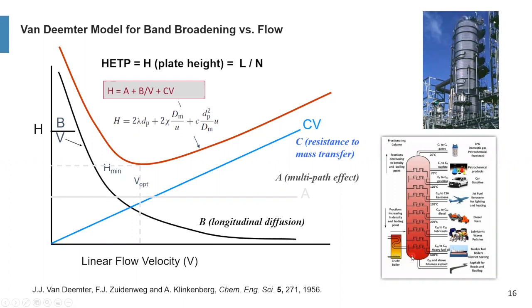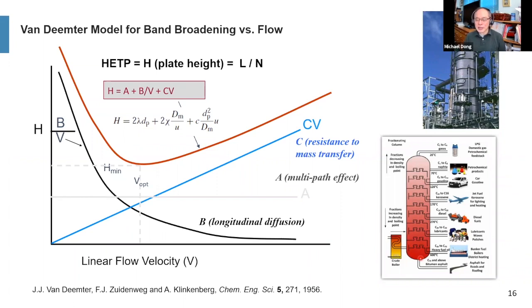At the bottom is your bitumen and asphalt, right? You use it for paving roads. So this is the distillation process. The more plates you have, the more fractionation, the more separation you get on the crude oil, right? Okay, so here is the Van Deemter curve.